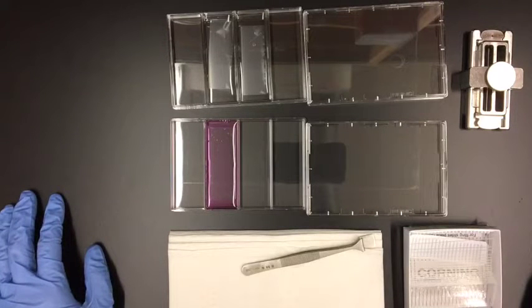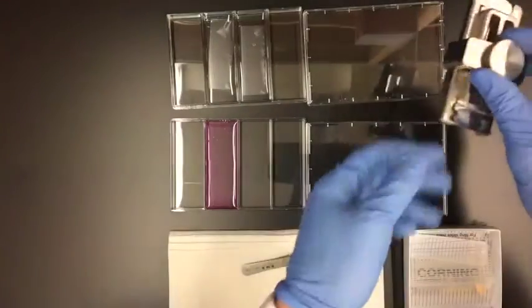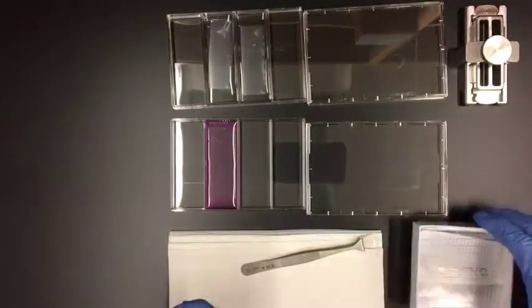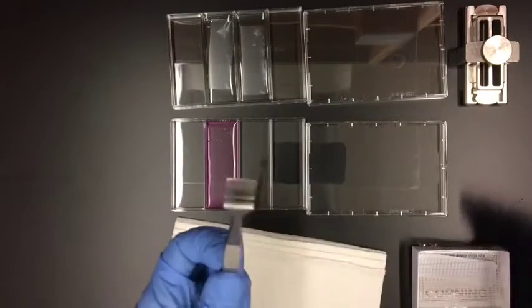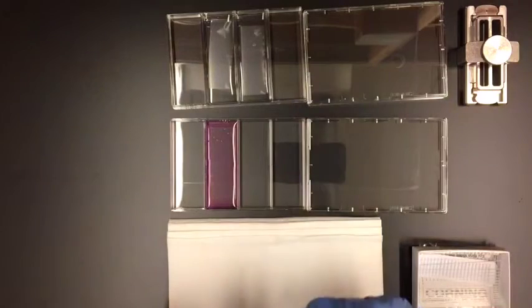So now I'm going to show you how to seal the array. You want to make sure that you have everything ready: your clamp, some extra slides, wafer forceps, some paper towels, and your membranes that are already pre-treated and hydrated.